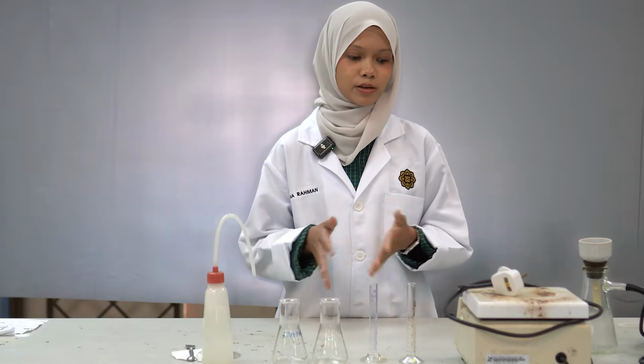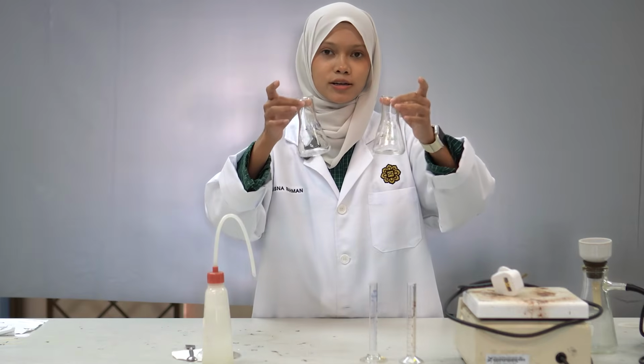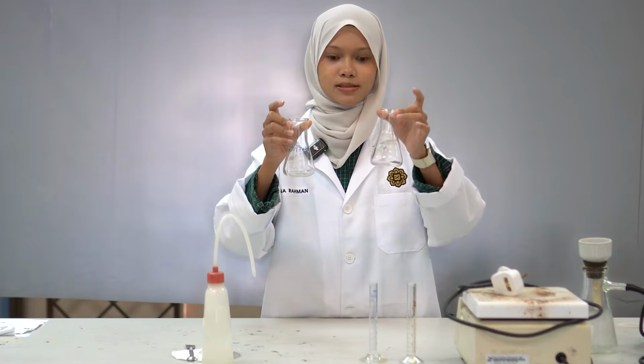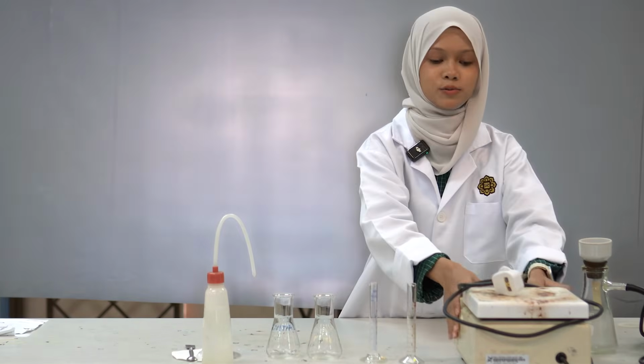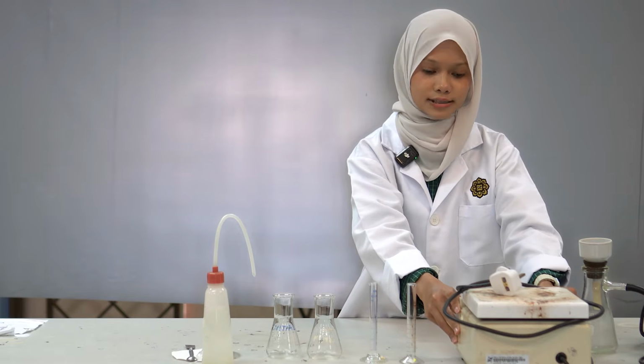So for the next part, I'm going to explain the equipment that we're going to use and the procedure. First, we're going to use 2 conical flasks, which we're going to label as the single solvent flask and the mixture solvent flask. And then we need a hot plate, which we're going to use for heating our solvent later.